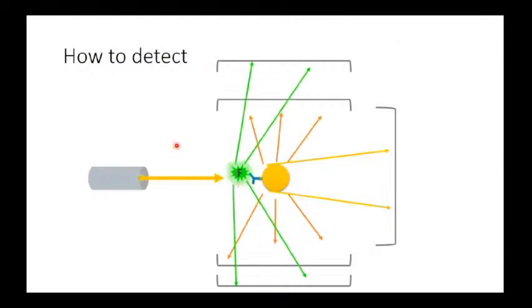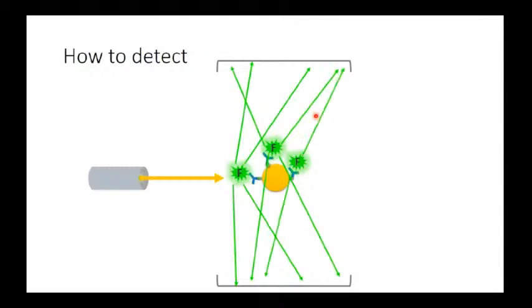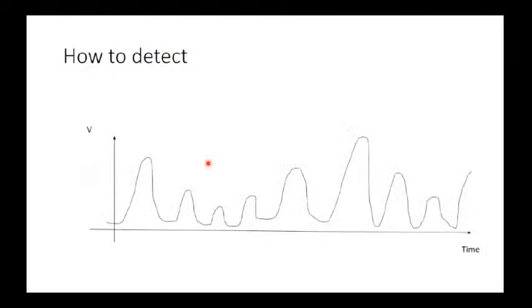All these detectors are connected to the computer, which gives me the exact data about every event. Of course, when the cell is expressing more proteins, there will be more fluorescence coming out of this cell.